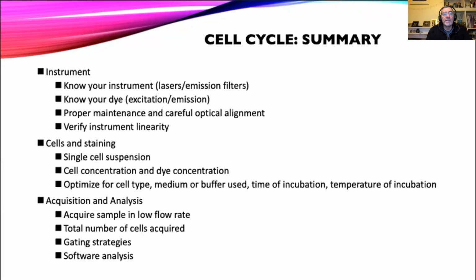Remember, we always need to be aware of our cytometer, our instrument, which lasers, which filters we have in there, because aligning that to what we know about the emission and excitation of our fluorochromes will tell us whether we can use those two things together. Of course, we always want to make sure that our cytometer is QC'd and performing optimally as well.